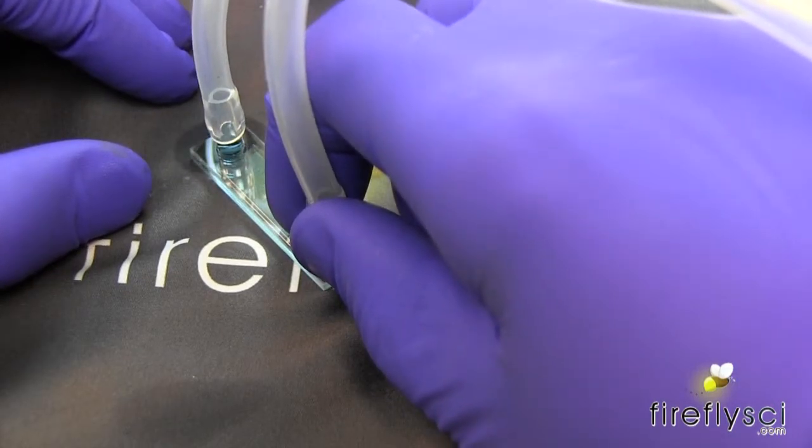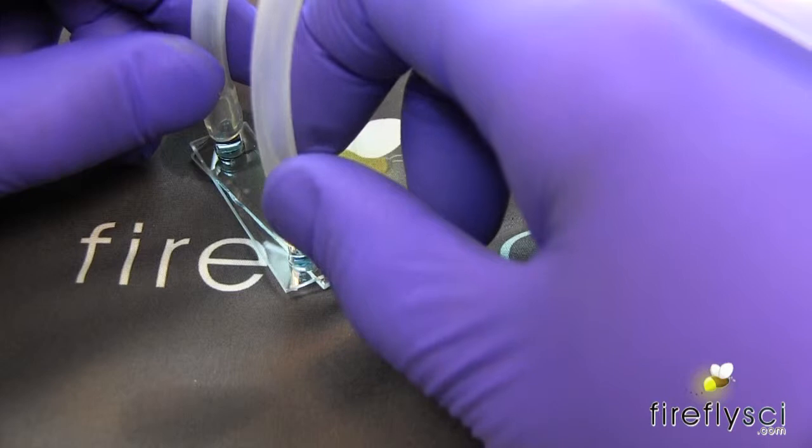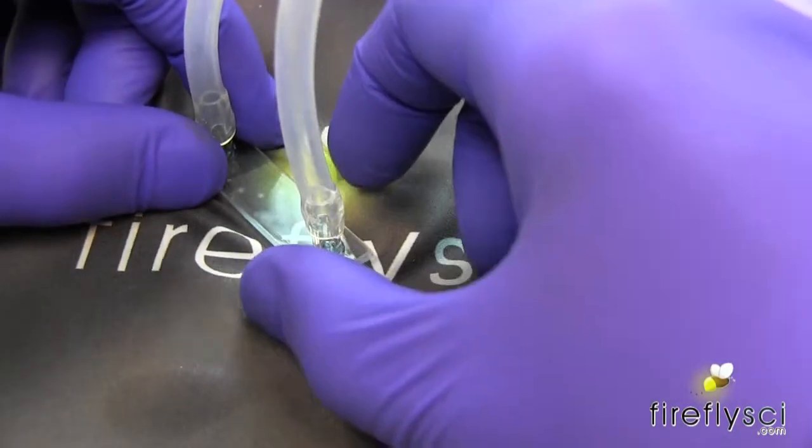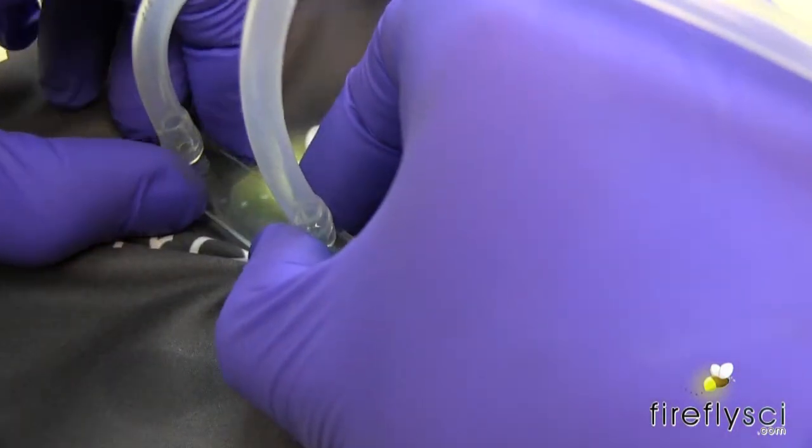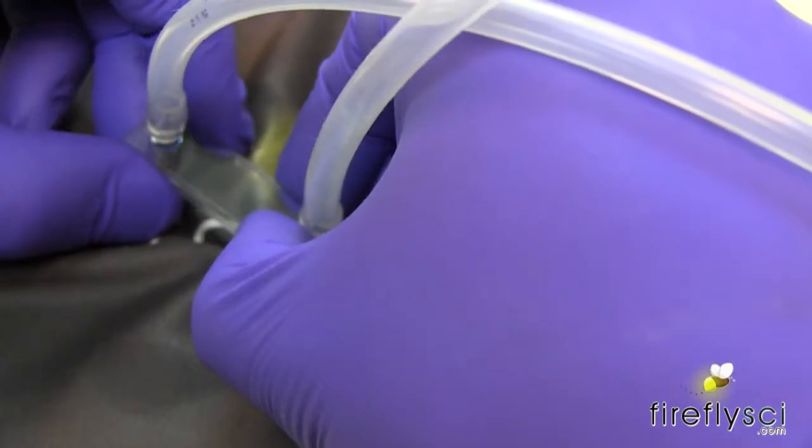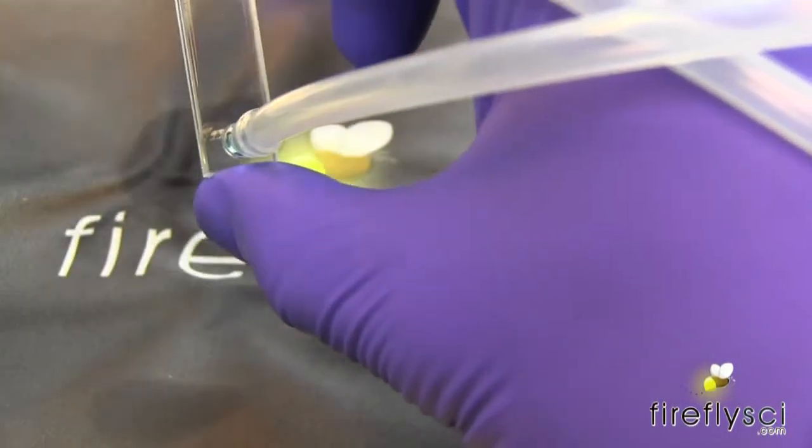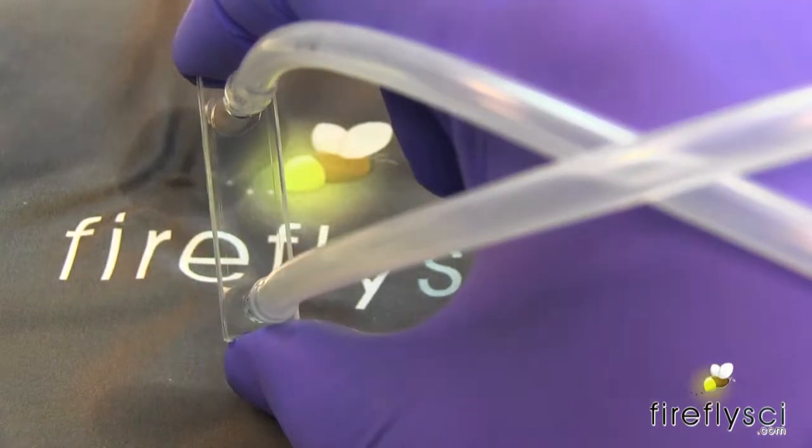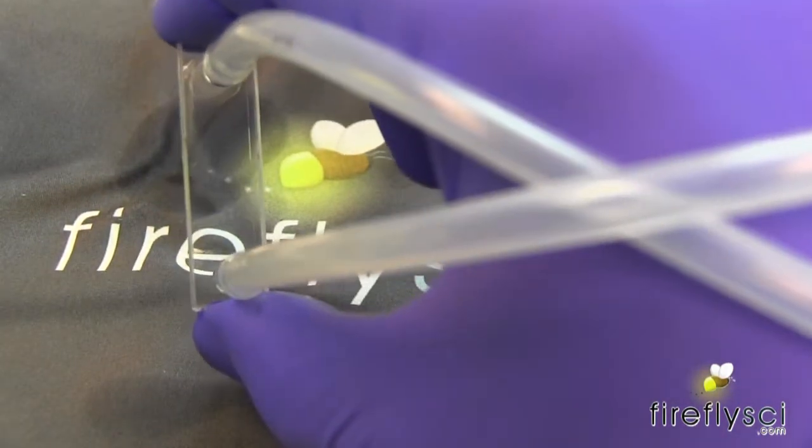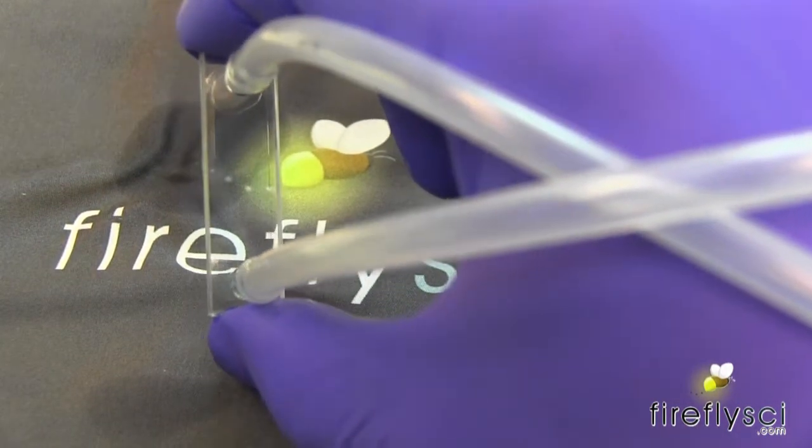It's okay if some of the sample gets out, but you really want to make sure that there's no air in there. That's most important. There we go. That's perfect. Now we're just going to put this in our cell mount and flow some sample through it.